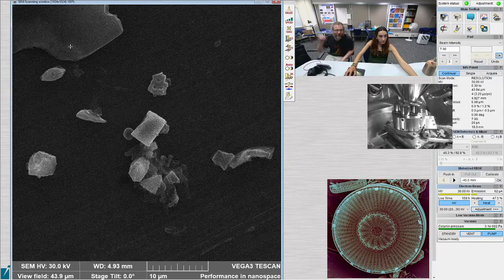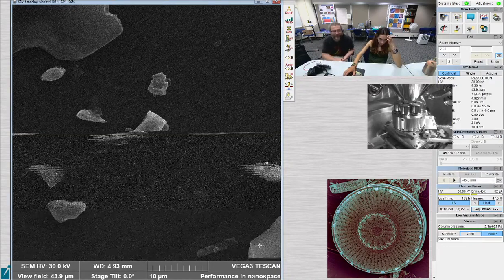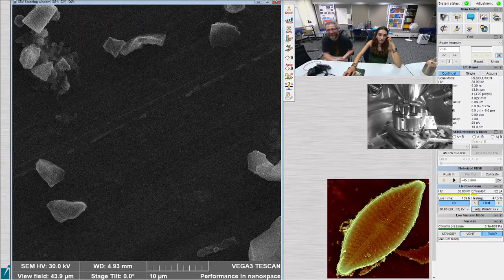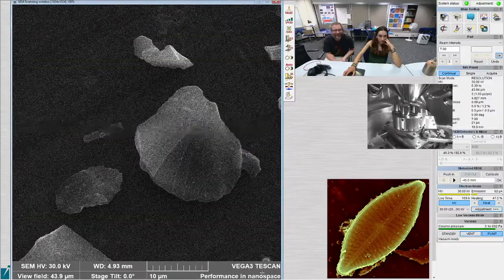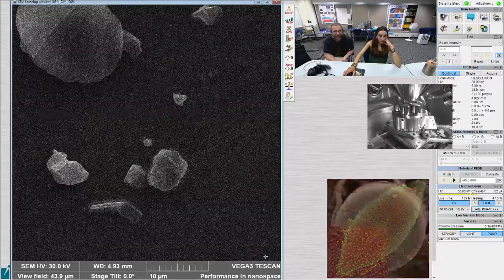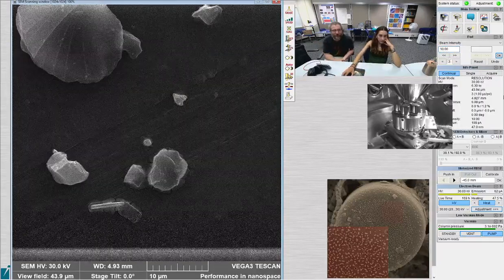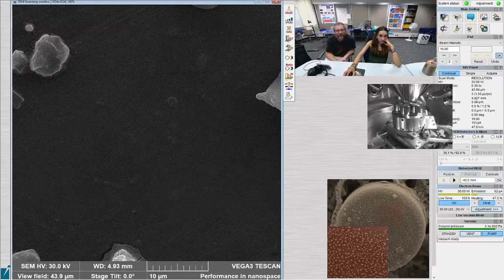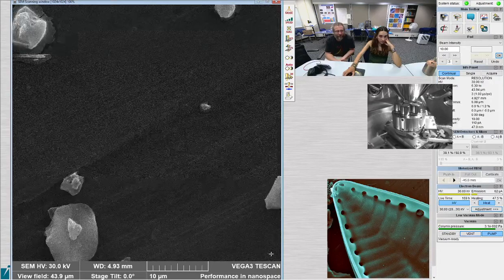Then I send them off to my colleague Mark, who has really nice specimen circling tools because he's a professional taxonomist. He puts all the circles on the slides, and they send them off to the museum. He's got friends at the museum, so he can actually get the accession numbers, and he knows all the paperwork for that end of things.